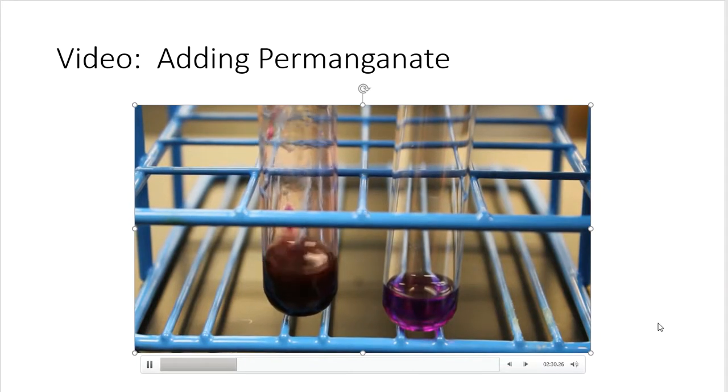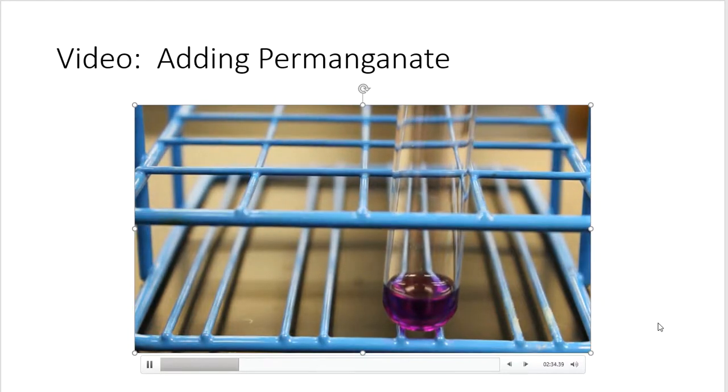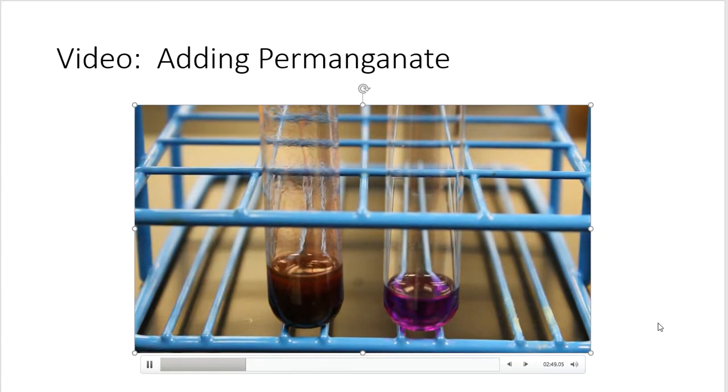16, 17, 18, 19, 20. All right, so after 20 drops, do you see any purple that is there? So once again, we'll set this to the side. Maybe we'll find out a little bit later on after it settles down. But folks, this is what we're after.